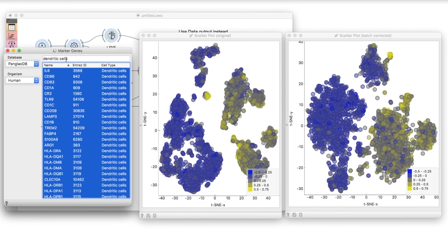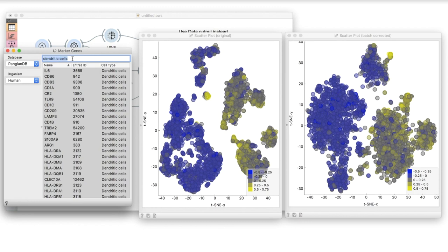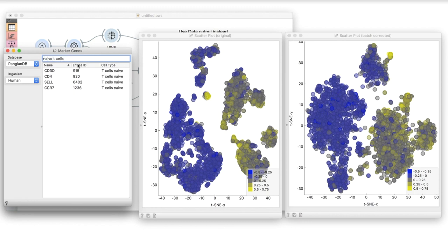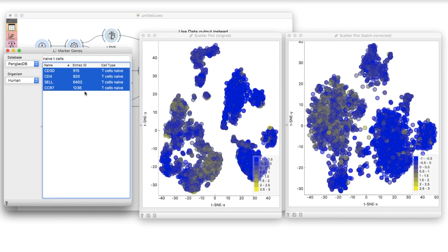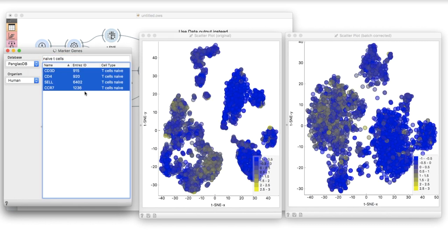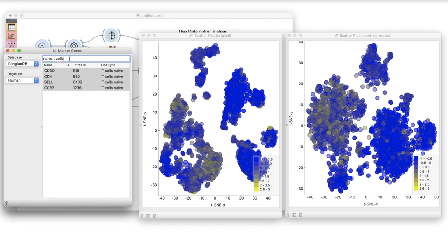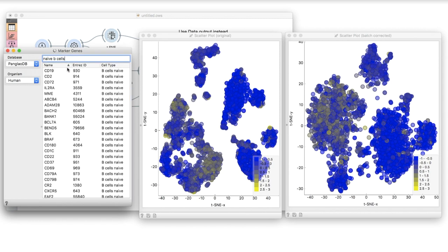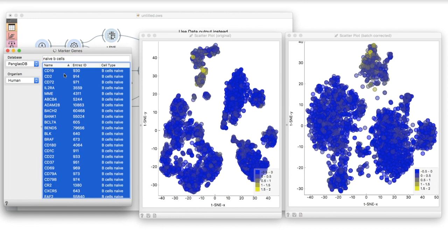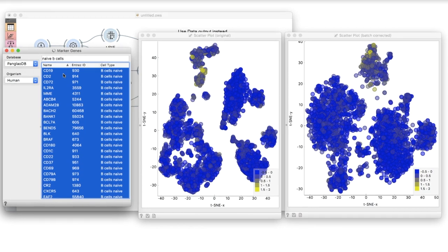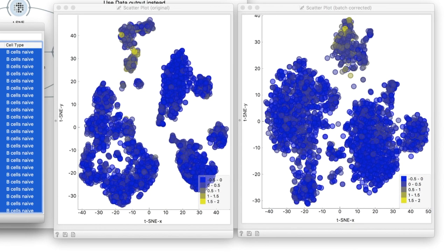We can examine remaining cell types, such as naive T-cells or naive B-cells. Notice that in the batch corrected data, the cells of the same type appear close together, often in the same cluster.